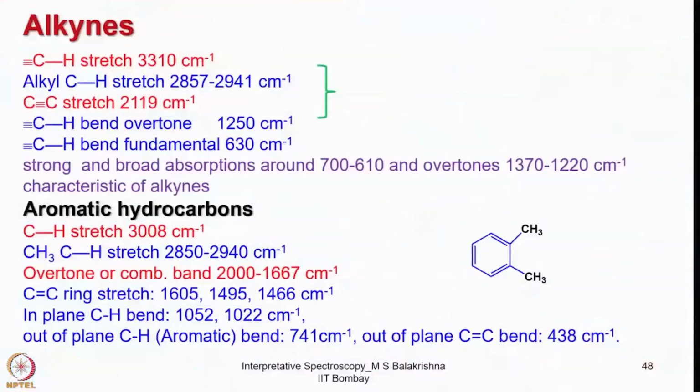For example, if you have a formaldehyde spectrum, one can see that there are a few different possible ways that bonds can behave, which leads to many different peaks. I will come back to that again. Before that, let's look into the alkynes. We looked into aliphatic hydrocarbons and also cyclohexane. Now we shall look into alkynes.